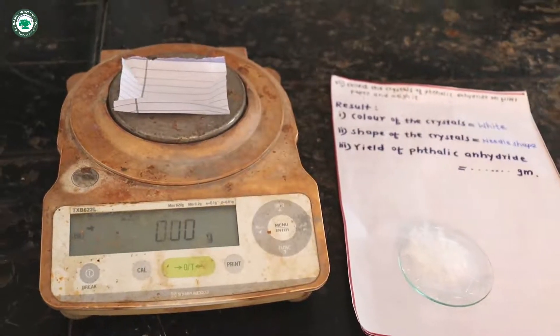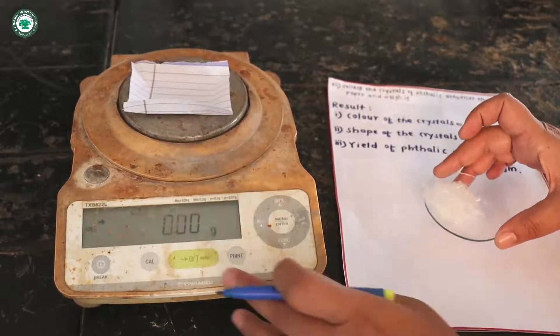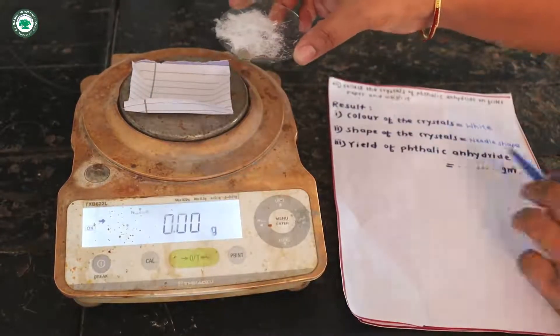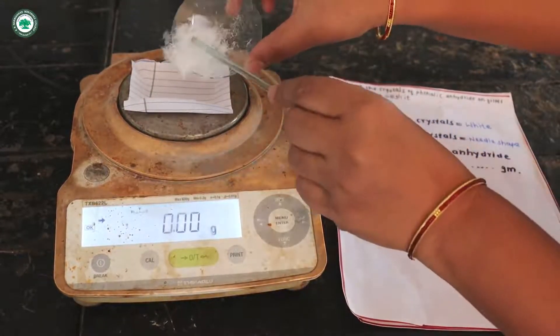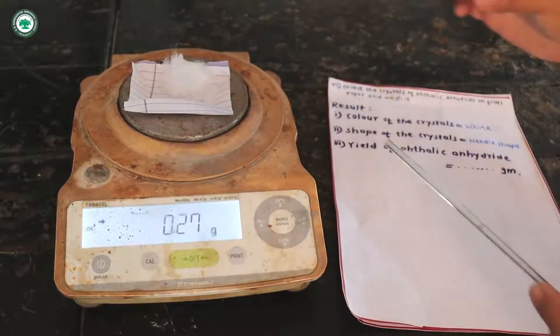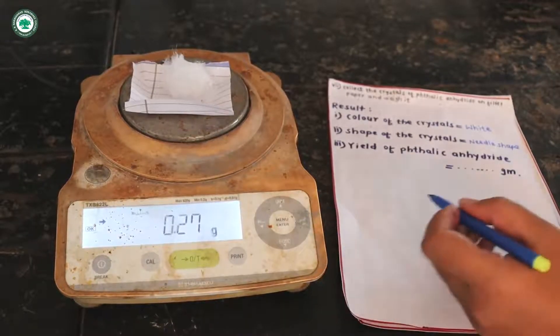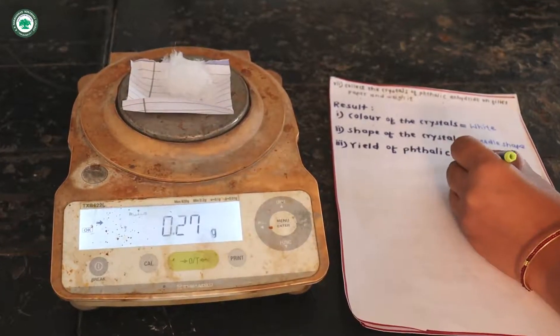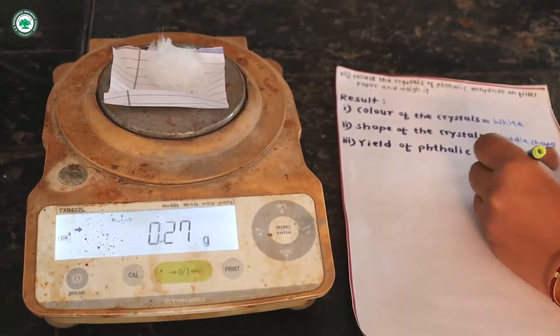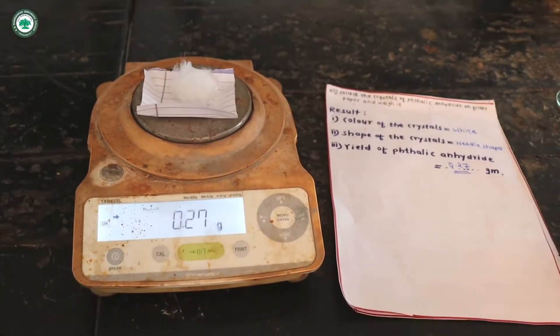And what is the yield of phthalic anhydride? It is 0.27 grams, this is the yield of phthalic anhydride. Thank you.